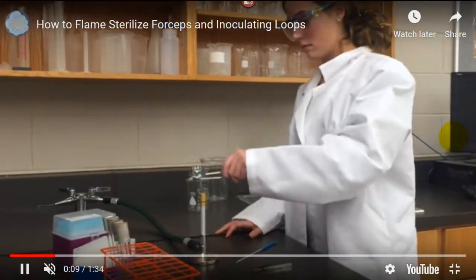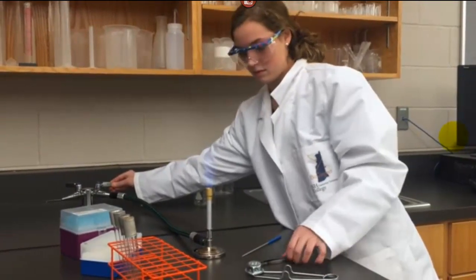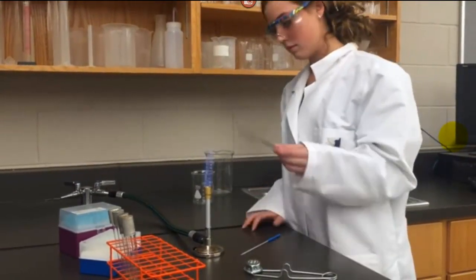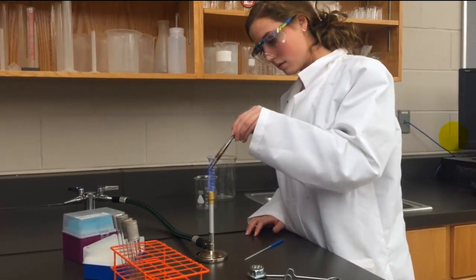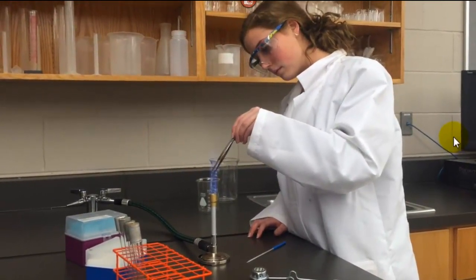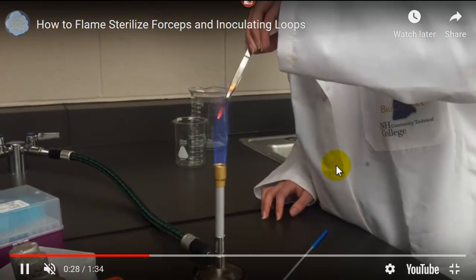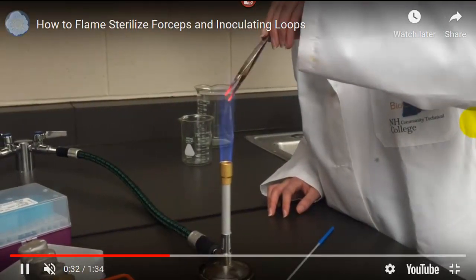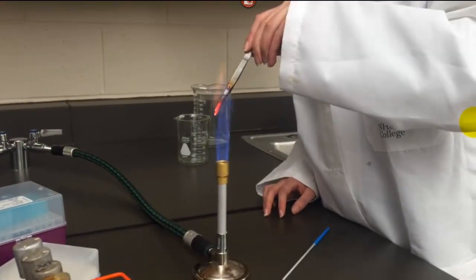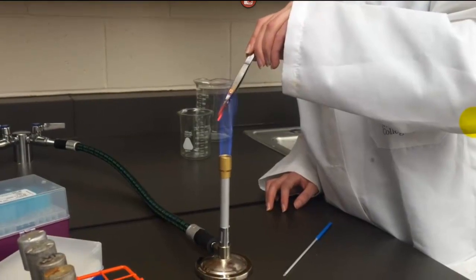All right, we're going to have a video here on, first of all, a person lighting a Bunsen burner. We do something similar to that, although that's a really good idea. We have matches. And she is now sterilizing some forceps. The blue flame is, of course, the gas mixing coming up. We have these in our lab as well. They're portable canisters. And she's sterilizing some forceps. And you see they're glowing bright red. So anything like that is sterilized.